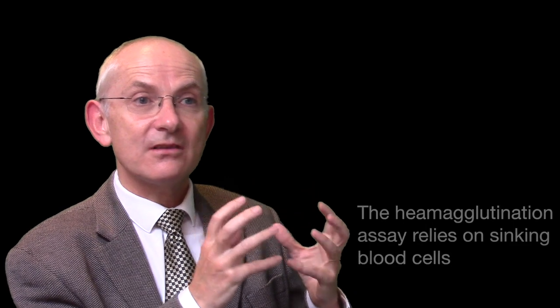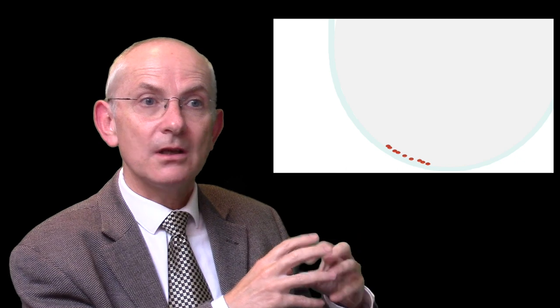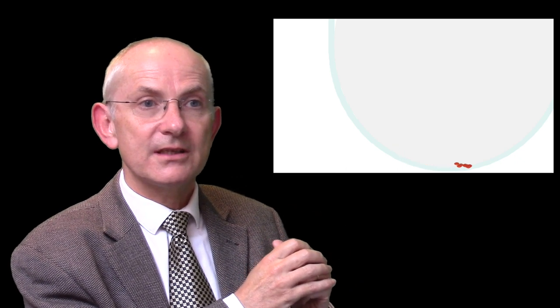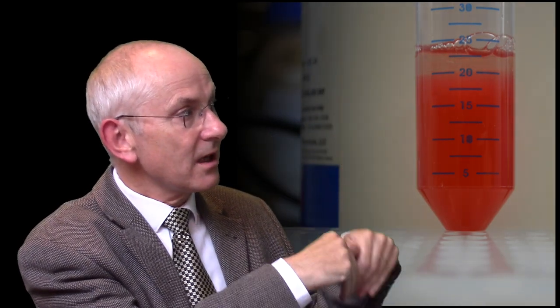This assay relies upon the very convenient fact that we can see what happens to red cells with our naked eye when they're in a vessel such as a round bottom well. On their own, they'll naturally sink to the bottom and form a button at the very tip. As you can see here, the cells are settling out under gravity and sliding to the very bottom of the tube.